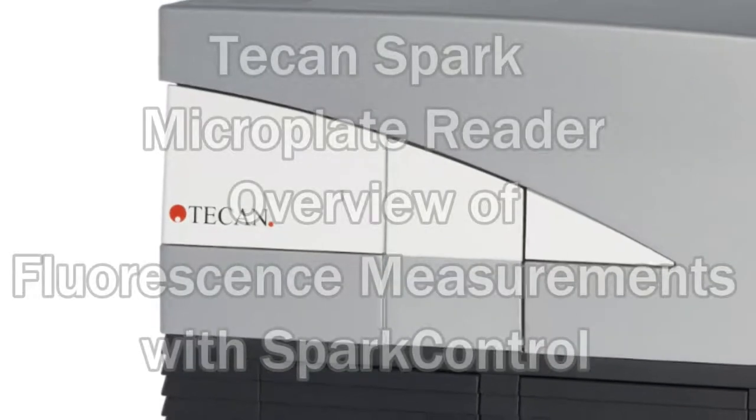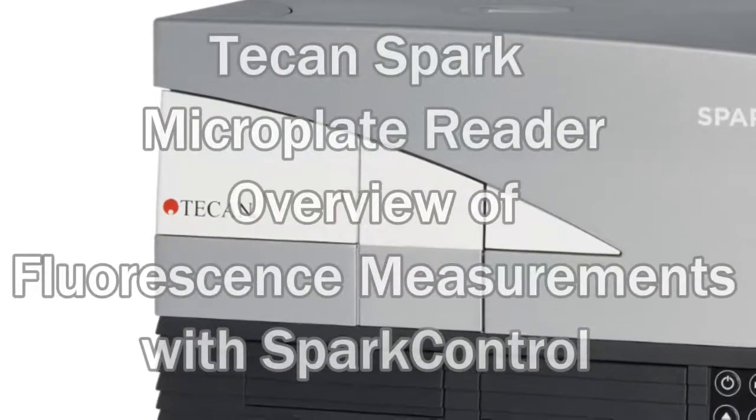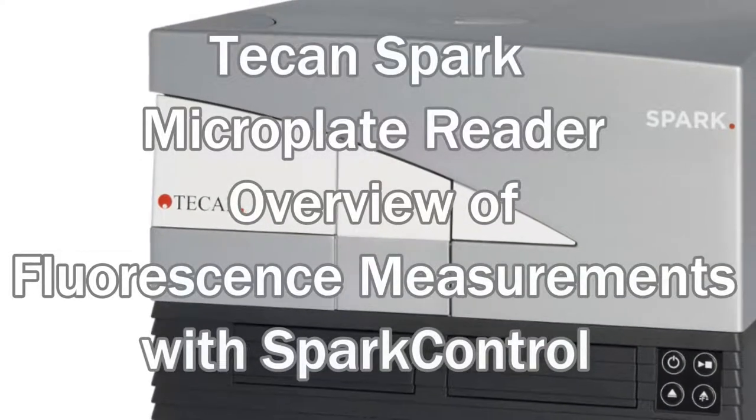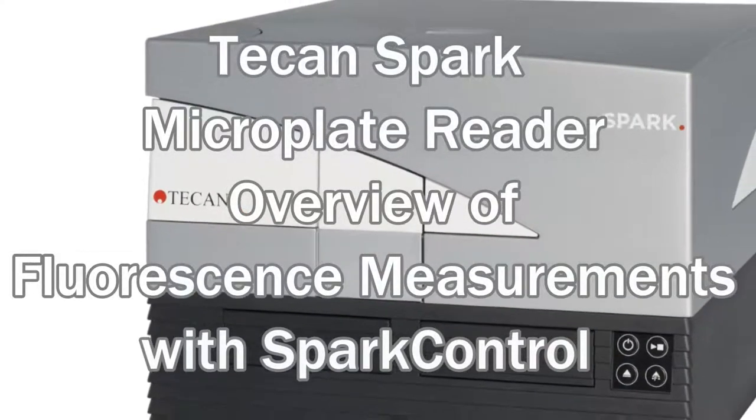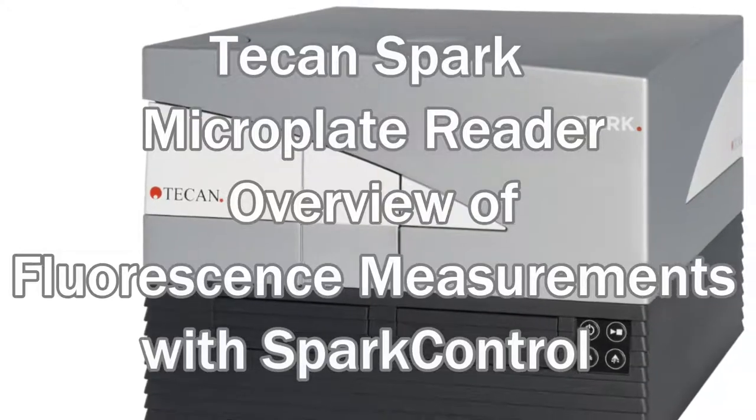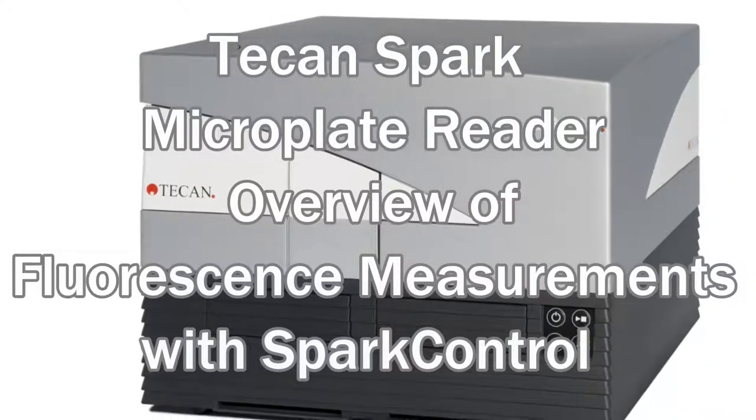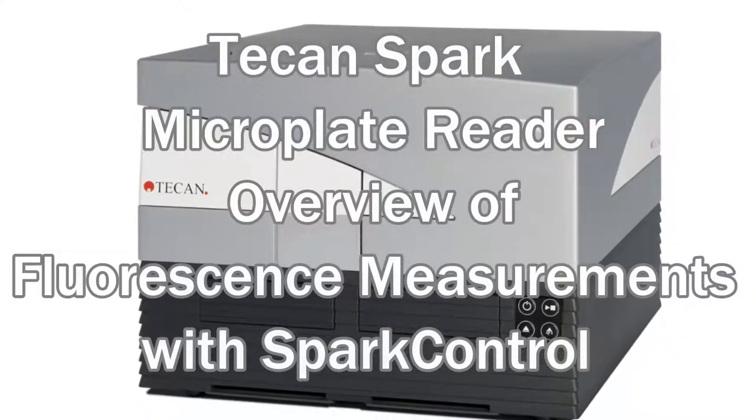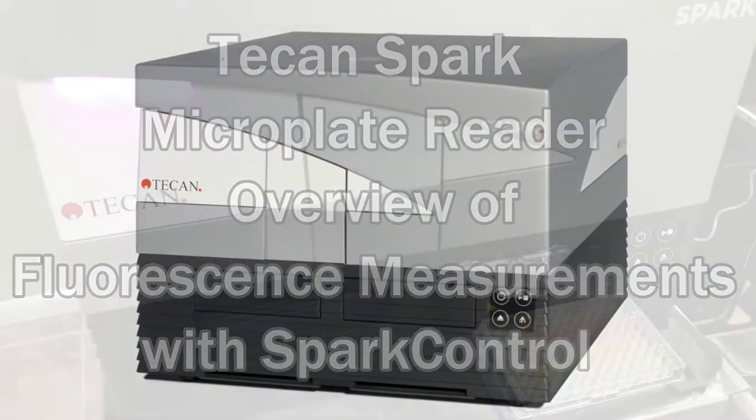Hi, this is an overview of how to take fluorescence intensity measurements with the TCAN Spark Microplate Reader and Spark Control software.